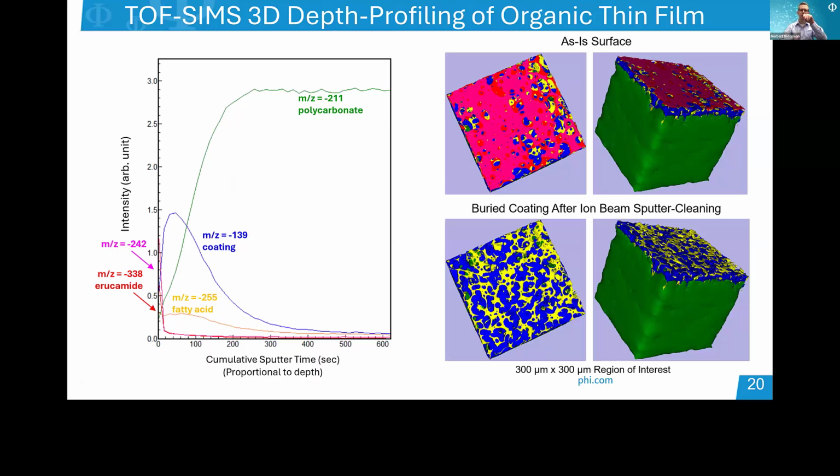This is a TOF-SIMS example of a thin film on a polycarbonate substrate. The depth profile on the left highlights TOF-SIMS' ability to track large molecules in the depth of organic materials, not possible with either Auger or XPS. The depth profile only shows the integrated intensities of detected ions in both the X and Y directions as a function of depth in TOF-SIMS. Viewing the same data in 3 dimensions enables the analyst to collect information on the homogeneity of the surface.